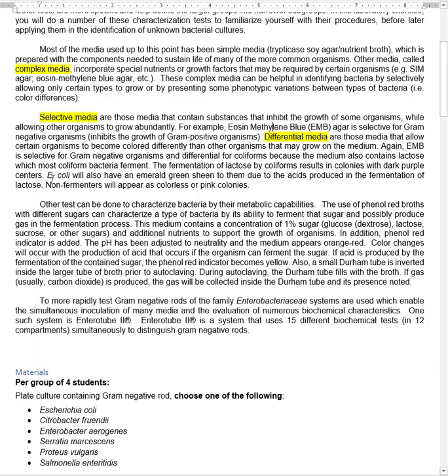And besides all of that, not only is it selective, it's also differential. So if the gram-negative bacteria happen to be the coliforms, the gram-negatives that live in the human colon, these guys have the ability to break down milk sugar called lactose, and this makes them different from a lot of the other gram-negatives. So EMB plates also have lactose in there.